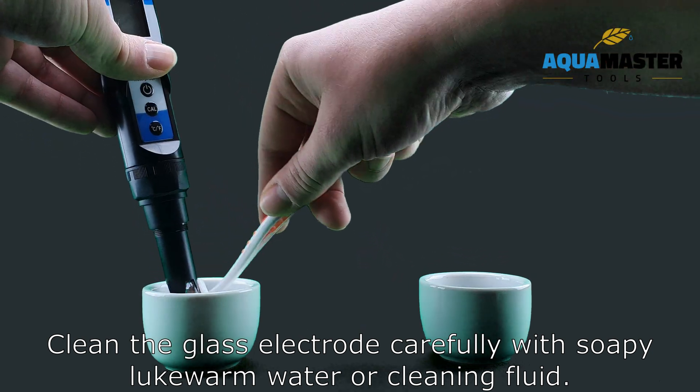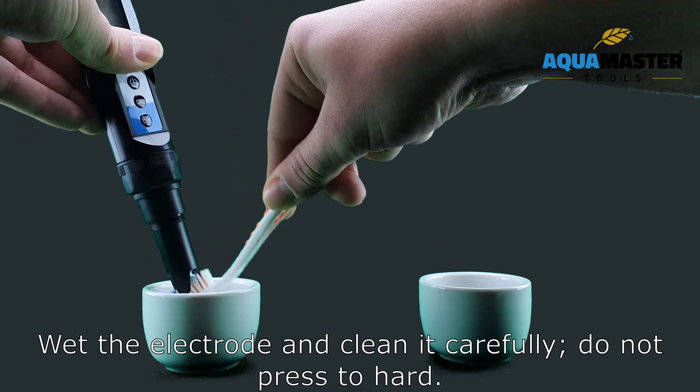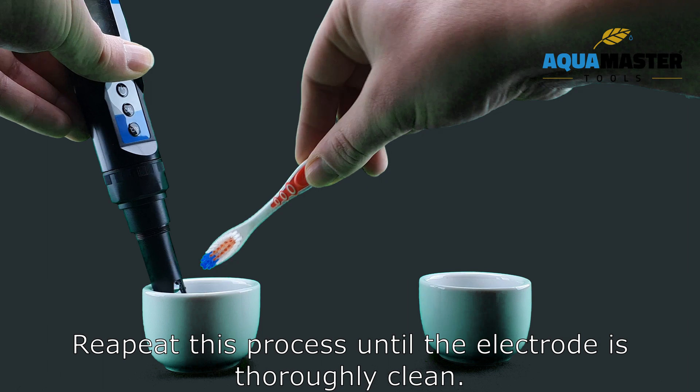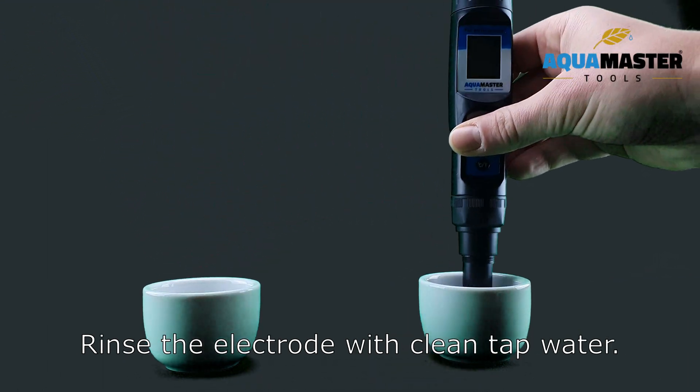Clean the glass electrode carefully with soapy lukewarm water or cleaning fluid. Use a soft brush for this. Wet the electrode and clean it carefully — do not press too hard. Repeat this process until the electrode is thoroughly clean, then rinse the electrode with clean tap water.